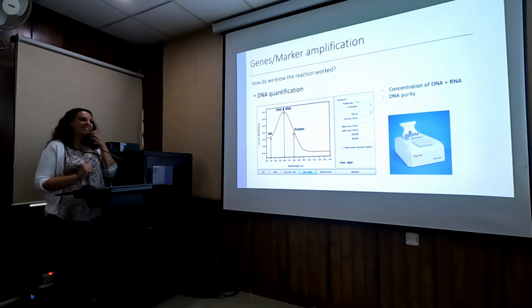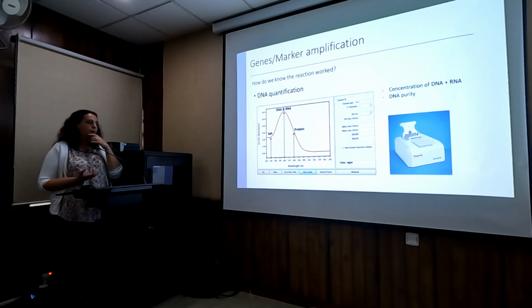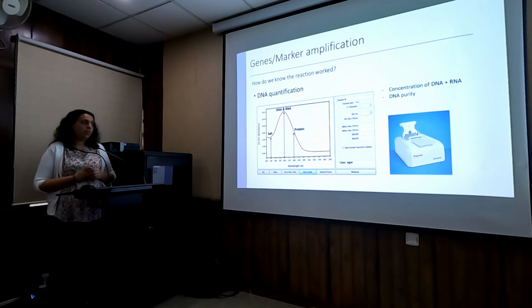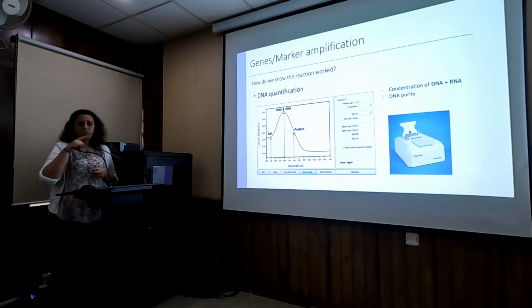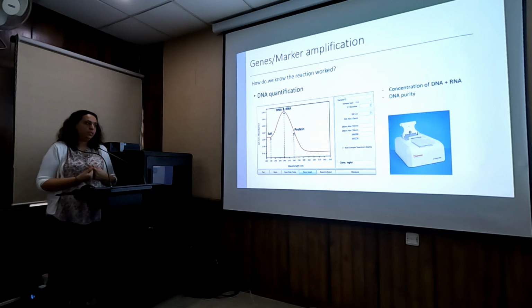Okay, but there are these DNA quantifiers, so they will give you a concentration of DNA, RNA, an approximation of the purity of DNA, and can give you information as well. If you have contaminants, what are they? So salts, protein can still be there. If you have phenols, you'll usually see a peak that tells us that the phenols we're trying to get rid of are still in there. So we can even see through that curve what else is in that sample that you couldn't get rid of during the cleanup.